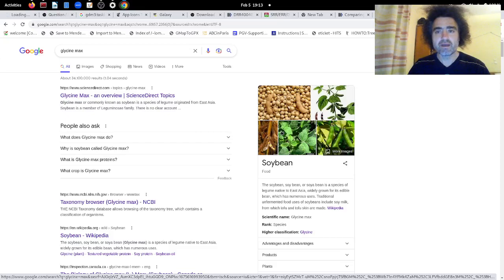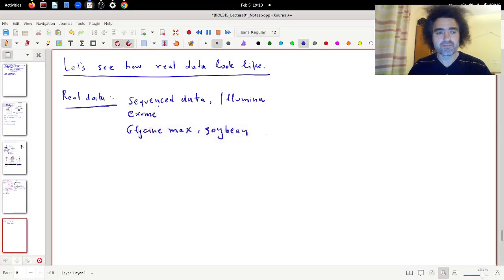Okay, now, when a scientist applies all the sequencing technologies in his lab, then usually they upload the data in some servers. There are three main servers around the world where they upload data. One is the NCBI. This is in the US, and the specific server that hosts the data is called SRA, if I remember well, Sequence Read Archive.